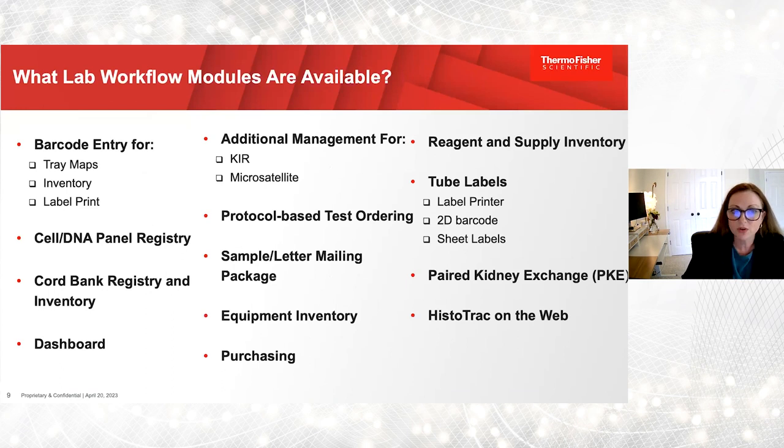Various laboratory workflows. You might need as part of your solution tube labels, which is very common. HistoTrac on the web we described a little bit earlier if you wanted your clinicians to log in and take a look at what samples are available. We do have a dashboard, which would allow usually management within the lab to understand where your tests and/or reports are in the various cycle.